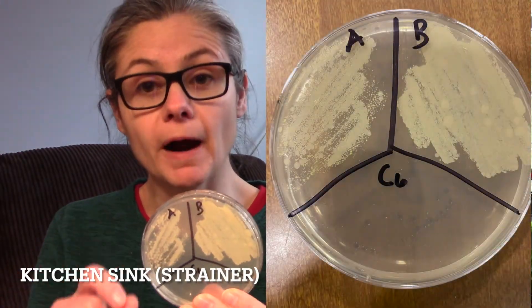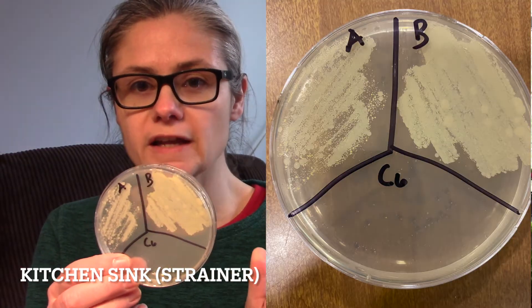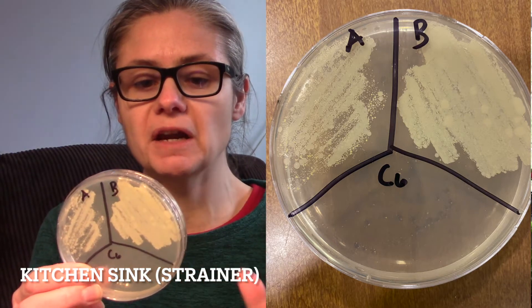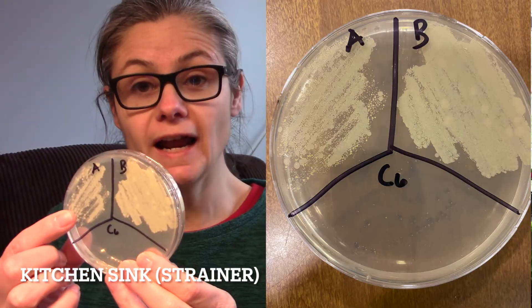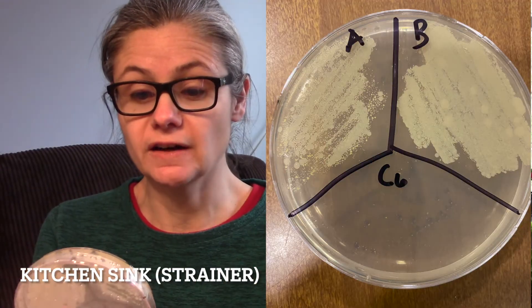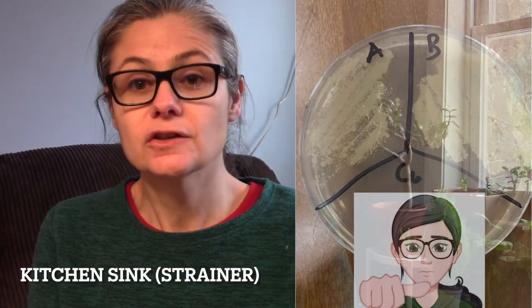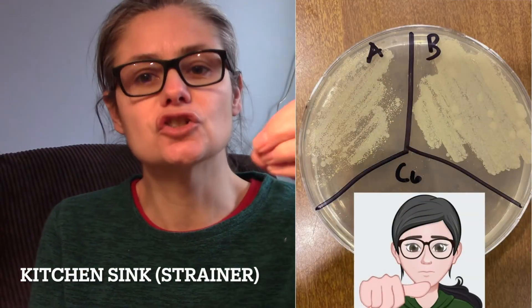The kitchen sink, the strainer part. I chose the strainer because I know that's an area always loaded with bacteria — and I was right. In B for before, there are tons of bacteria smeared in there, you can't count them. In A for after, we can see a definite decrease in bacteria, though not as significant as in the other areas. I would say it does okay at disinfecting the kitchen sink strainer.